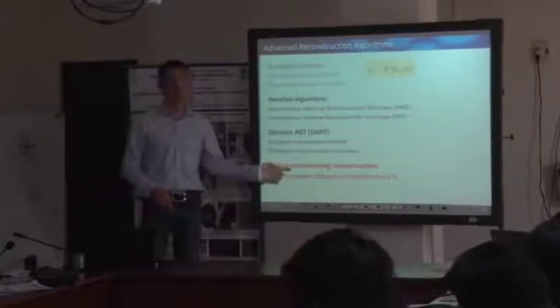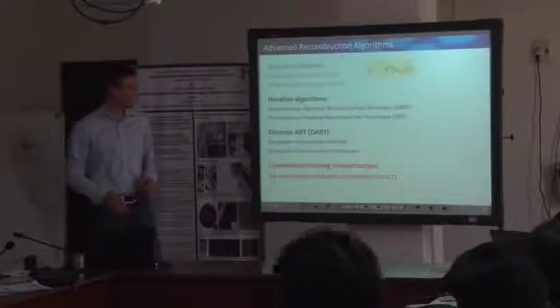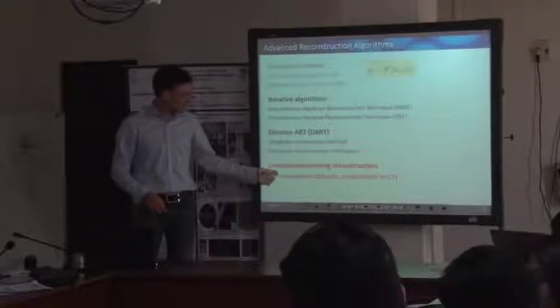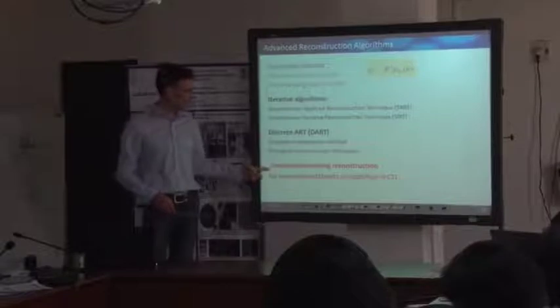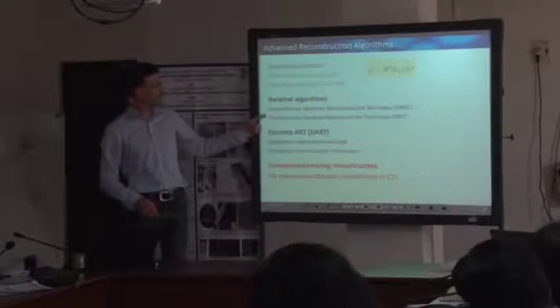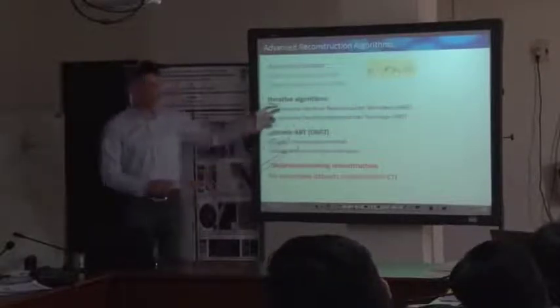The same holds for soft matter using NMR, but in principle, people work on that. This is what is coming up for electron tomography as well. So there are strong advantages. People use this so-called SIRT algorithm, so there are iterative procedures.